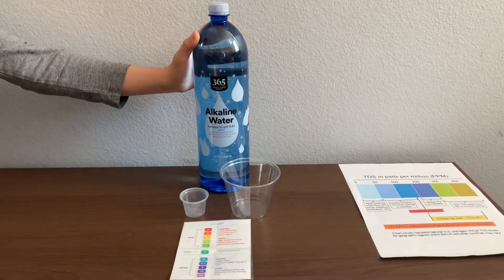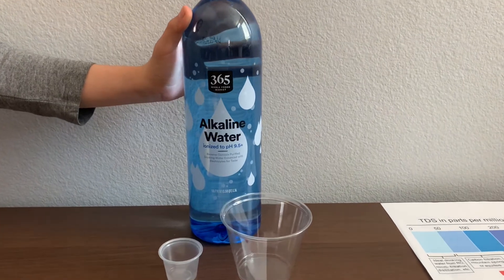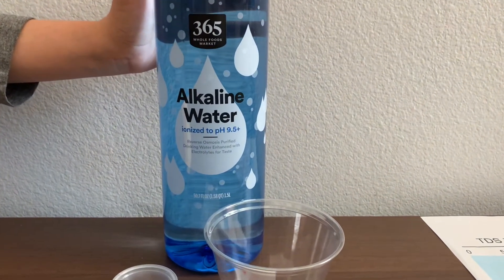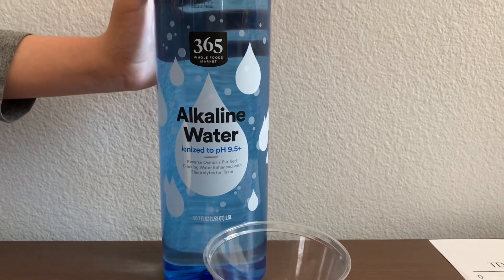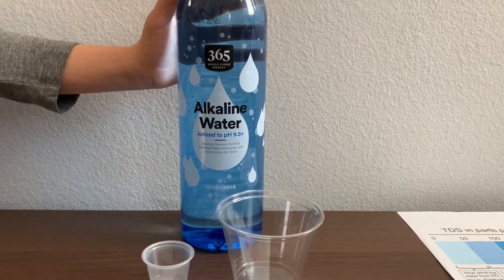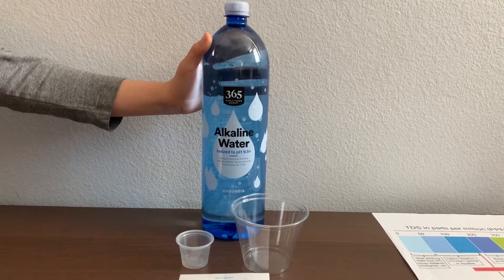This is 365 Whole Foods Market alkaline water, ionized to pH 9.5. This water is purified by reverse osmosis and infused with electrolytes for taste. 365 purified alkaline water is bottled in the USA and it's sourced from a municipal source in Las Vegas, Nevada.